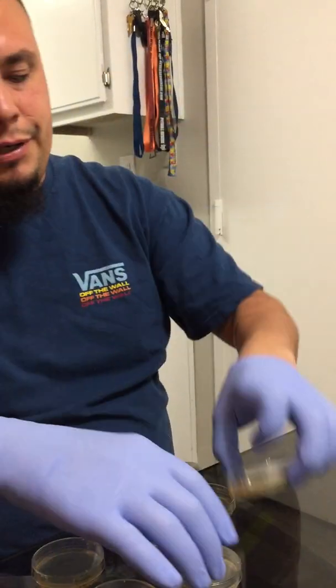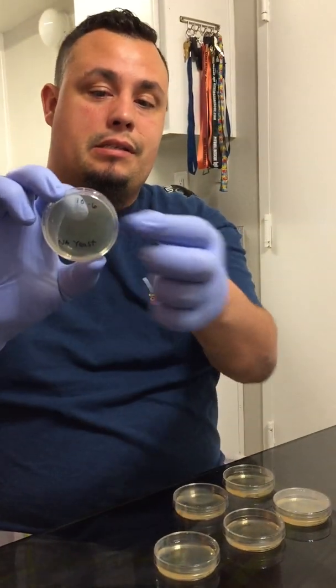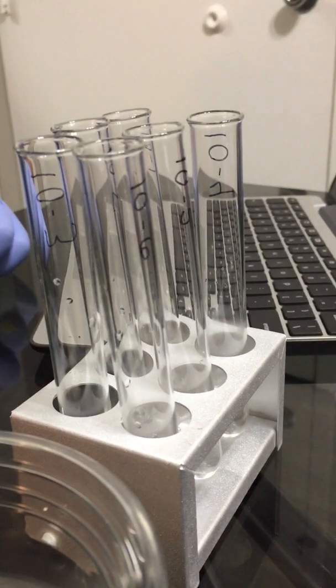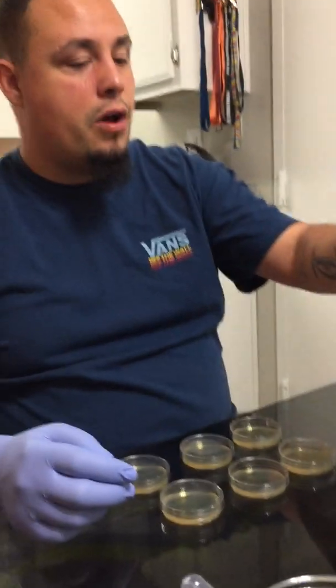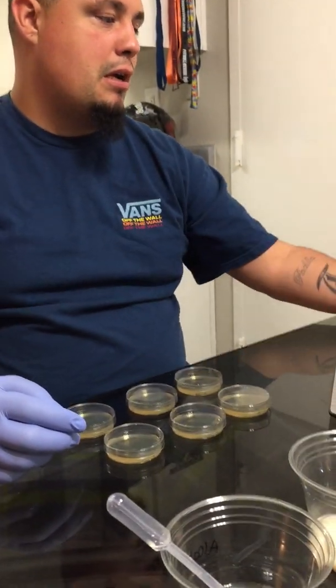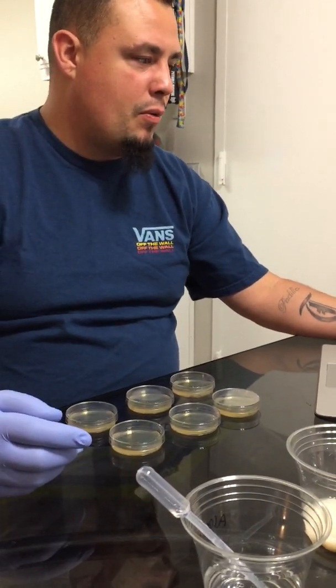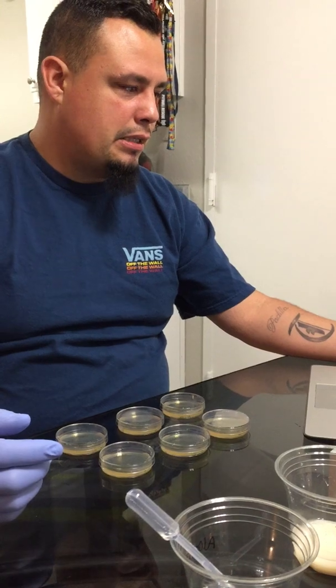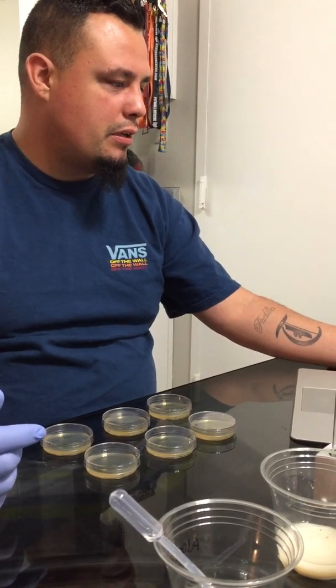They're numbered. We have 1, 2, 3, 4, 5, and 6. Numbered just as well as the tubes. We have 1 through 6. I have already added 2.25 mLs of distilled water to each of the test tubes. We went ahead and got our yeast mixture here, and it's been sitting for over 10 minutes. There's a little bit of water in the yeast mixture.